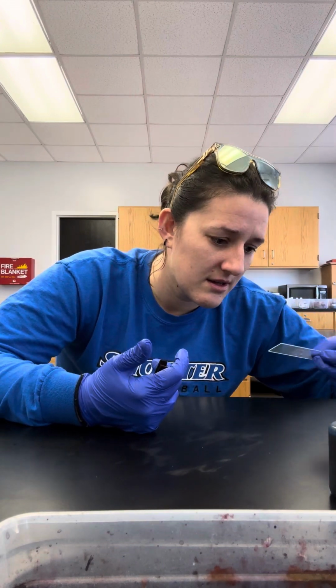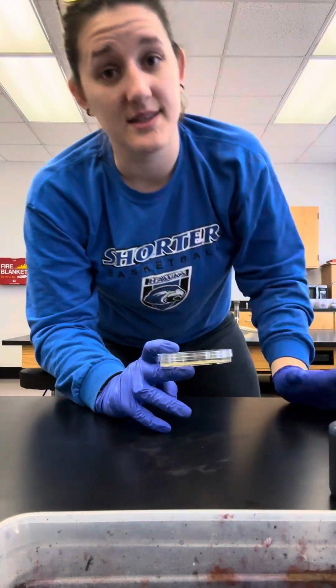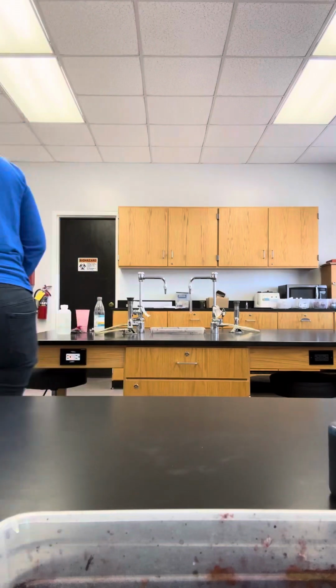Okay, let's check on our slide. Oh, we're still a little juicy in the middle, so we're gonna let that dry some more. At this point, I'm finished with this, so I'm gonna go put it up so that it doesn't smell bad. Not that I can smell much anyway.